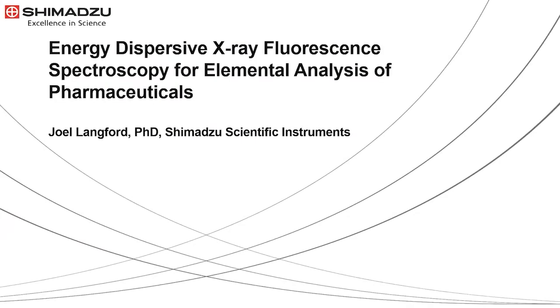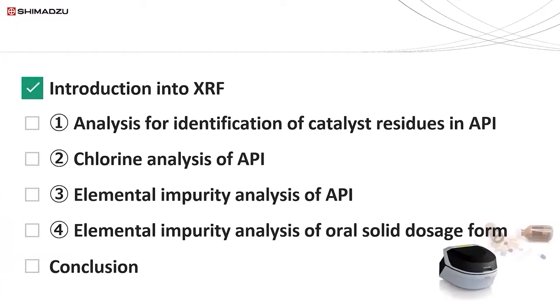Again, if you are just joining us, I'm Joel, your moderator and speaker. Today, I will be talking about X-ray fluorescence spectroscopy for elemental analysis in pharmaceuticals. So just a brief outline. I'm going to be providing a very brief introduction into X-ray fluorescence, and then afterwards, we will be discussing pharmaceutical-centric X-ray fluorescence applications. And then I'll finally conclude.